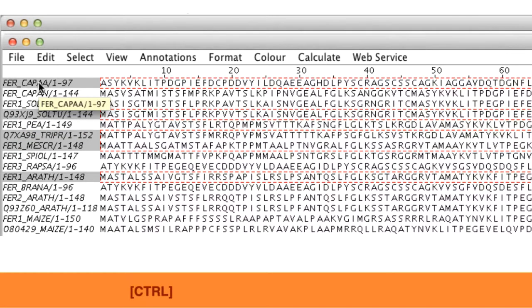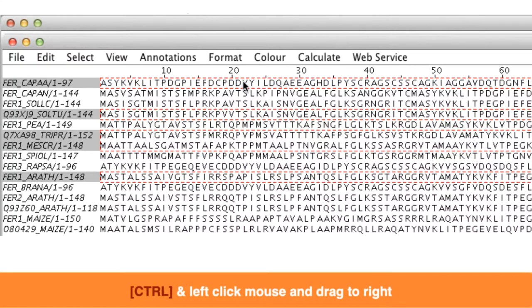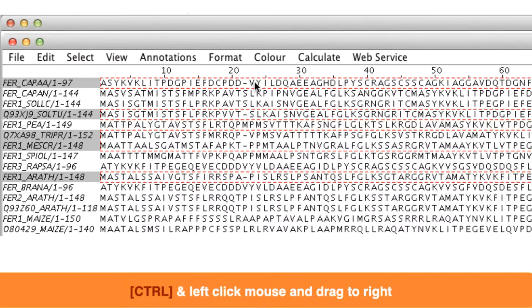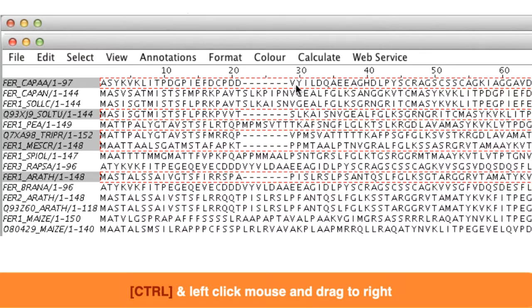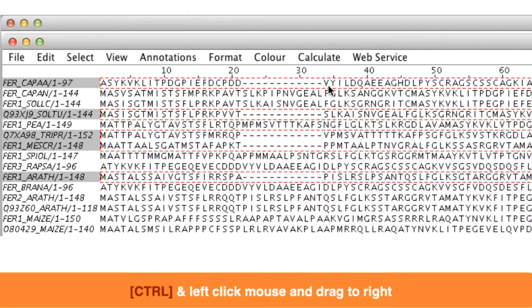Then, keeping the CTRL key pressed, I move the mouse cursor to the immediate right of the position in which the gaps are required. I then left click the mouse and move the cursor to the right. The gaps will appear to the left.